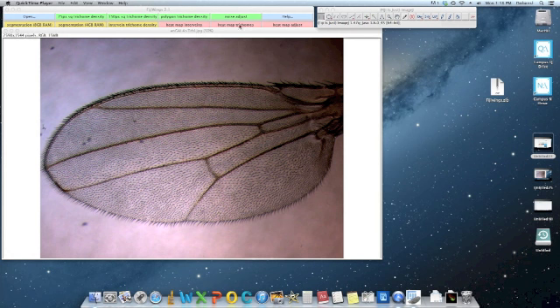The heat map trichomes tool allows the user to identify all the trichomes on the wing, to connect the dots, if you will, between trichomes, and then assign an area to each subtended region and apply a color. The heat map that results gives the user an idea of the distribution of trichomes in a particular area.